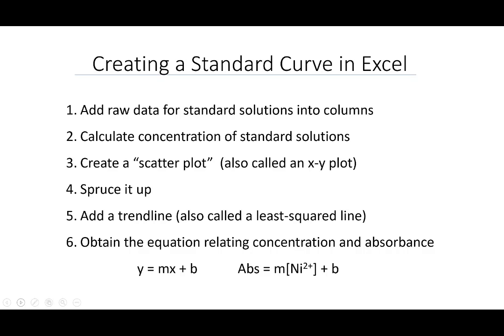We're going to add the raw data that we obtained for our standard solutions into columns in Excel. Then we're going to first calculate the concentration of nickel 2+ from the data. Then we're going to create a plot called a scatter plot, which is an x-y plot, where the x-axis will be concentration and the y-axis will be absorbance.